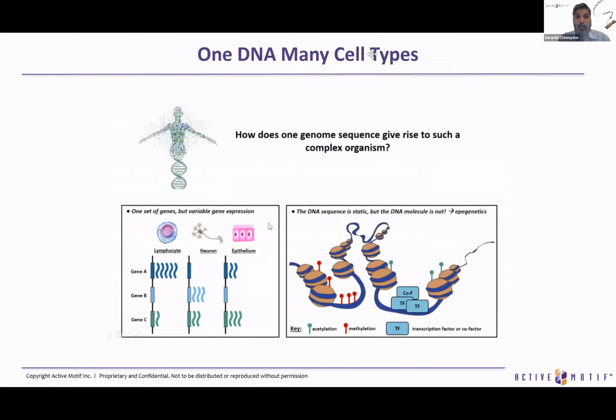Epigenetics actually is the mechanism that regulates and defines the phenotype of certain cells. In all the cells in our organism, we have the same DNA, but the characteristics come from different epigenetic mechanisms. Here, the main ones are depicted: histone modifications, DNA methylation and DNA modifications.